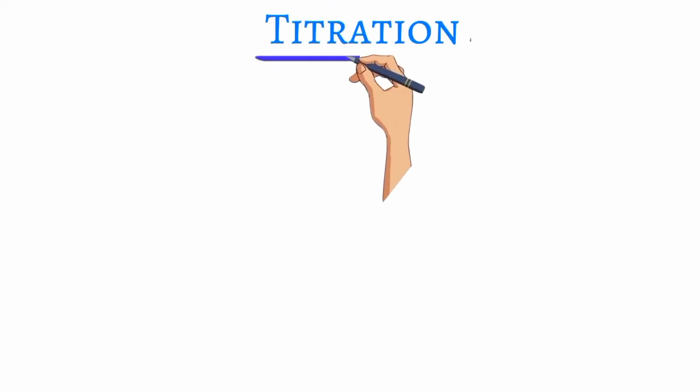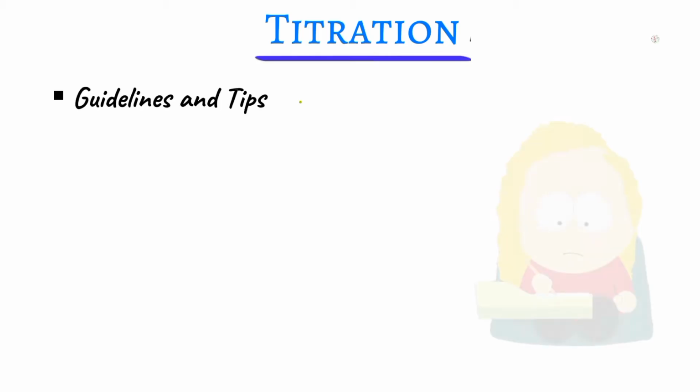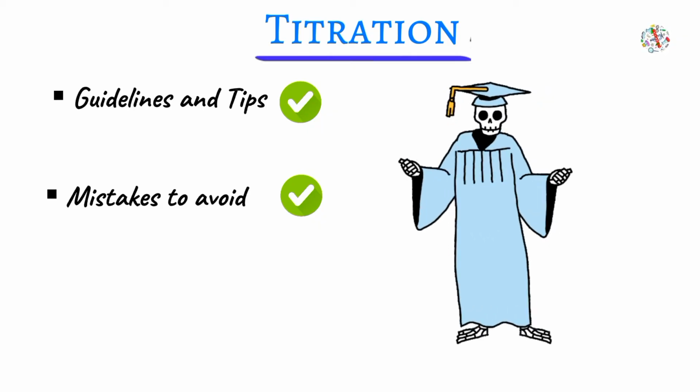Titration. In this video, we are going to have an in-depth discussion on titration, and I'm going to provide you with guidelines and tips that will not only ensure you have a deeper understanding of this concept, but also help you get everything right in your titration practicals.